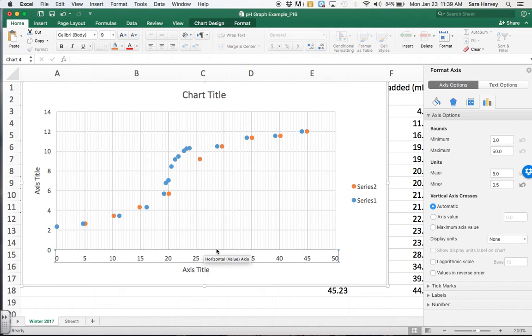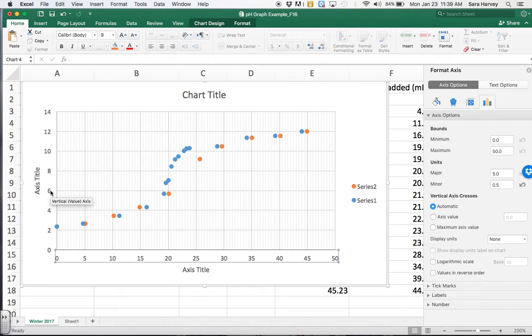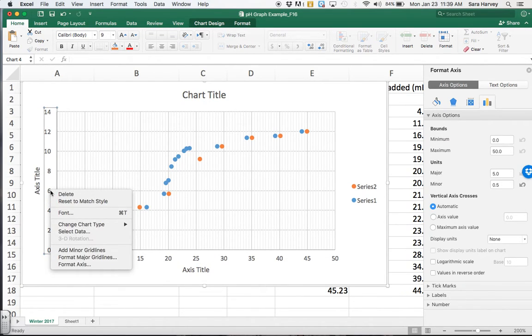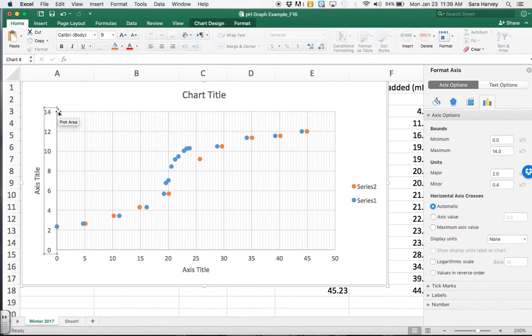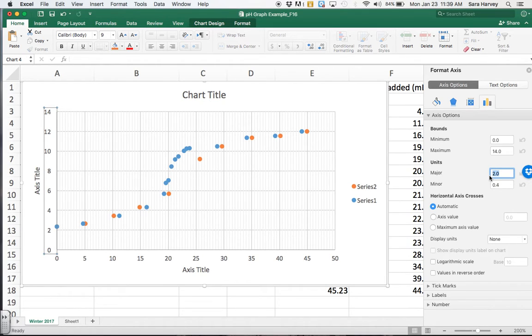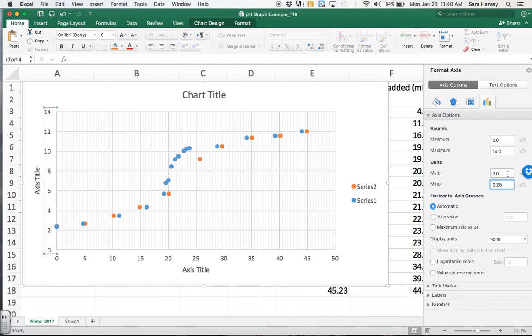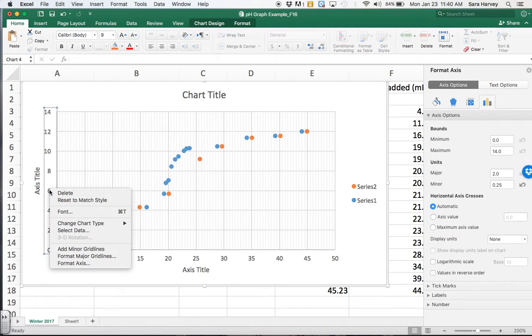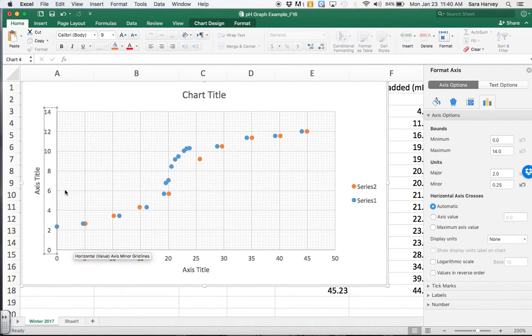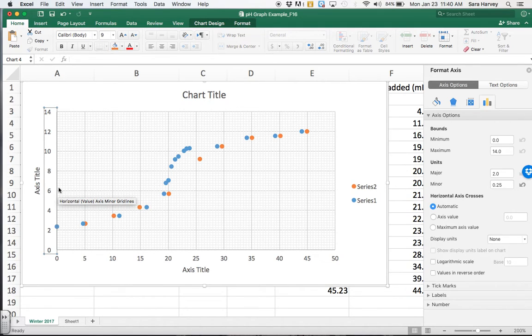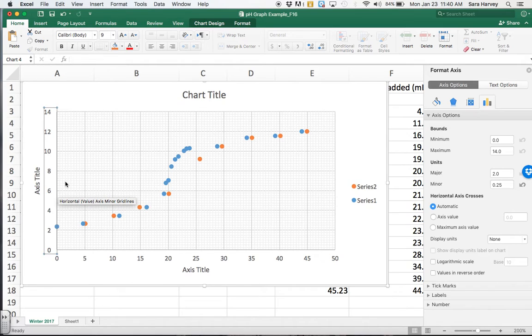You know, the same thing for pH. Right-click, control-click, Format Axis. And now I can see my bounds. I go from zero to 14, which is great. Major every two, minor every 0.4. So I'm going to do a major every two is probably fine, minor every 0.25. Let's see what that looks like. And now I need to go back, control-click or right-click, and add minor grid line. The majority there. And now I have a grid line every 0.25 pH units, and that's going to be really helpful.